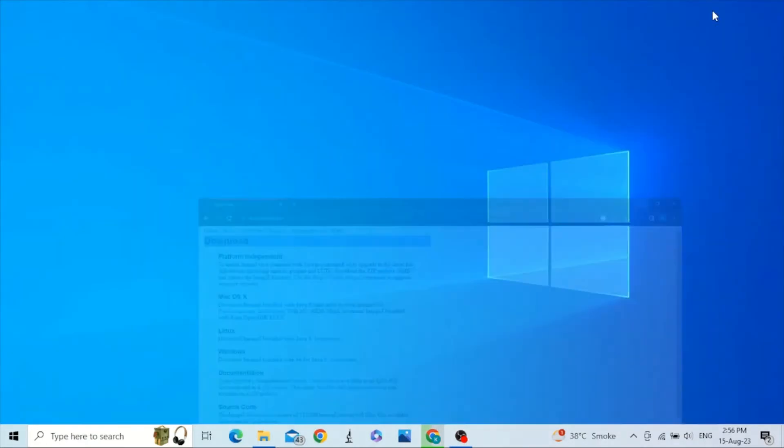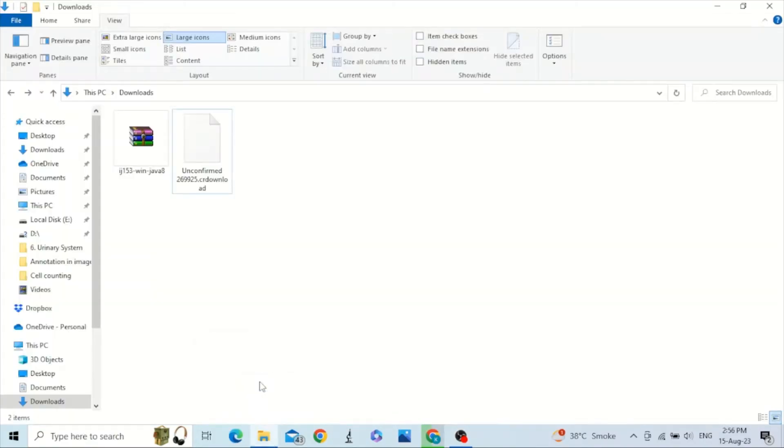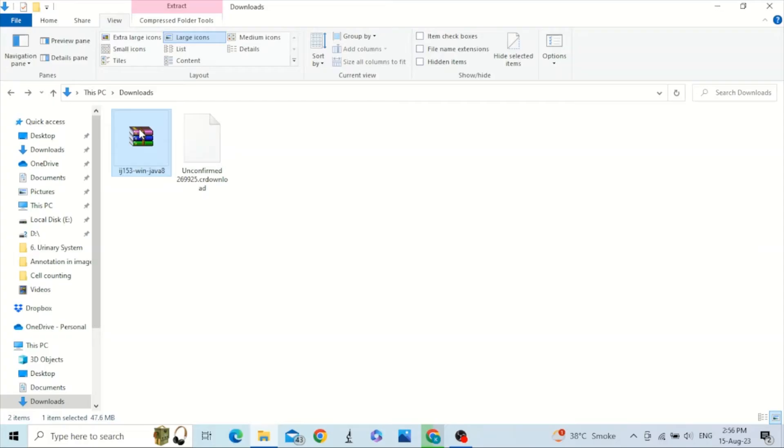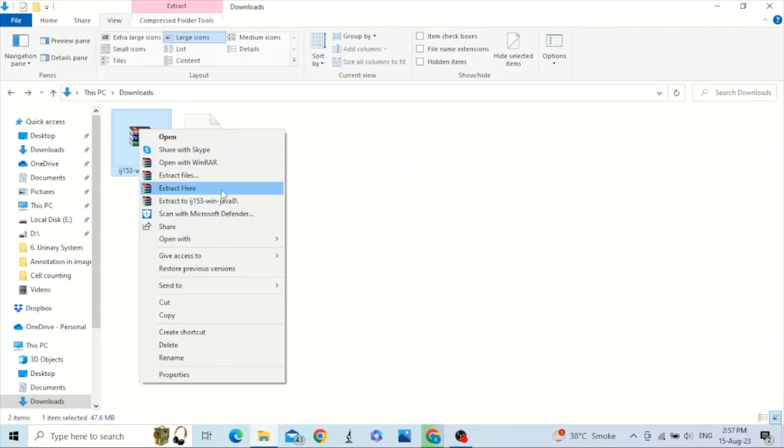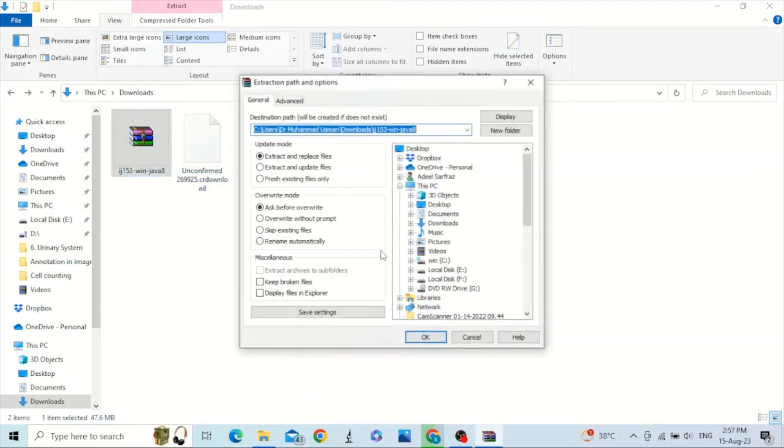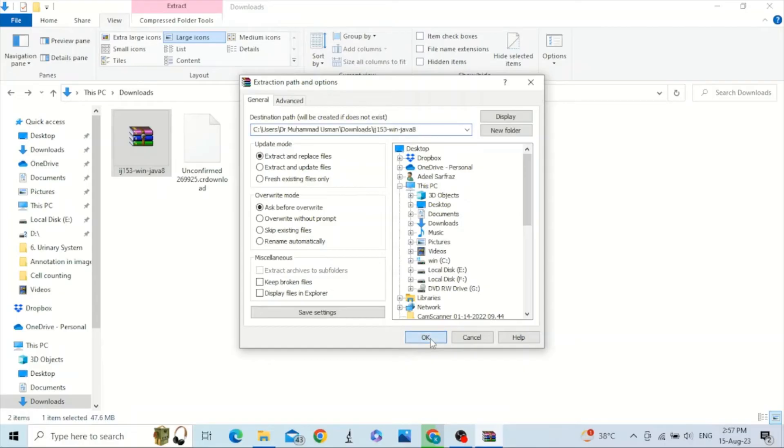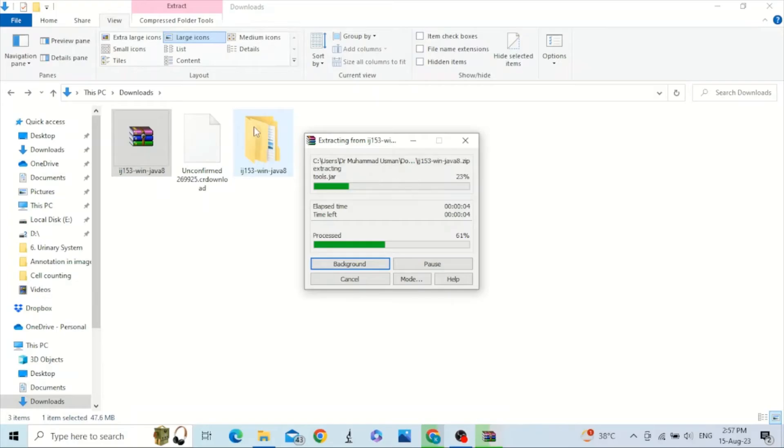Okay, we have the already downloaded ImageJ. Just right-click here and extract files. Extract these files. The files in this folder will be extracted in this folder.